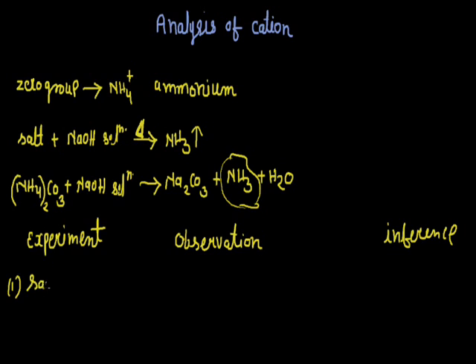So we take the salt and add NaOH solution to the salt. The observation is that an ammoniacal smell comes out from this test tube.